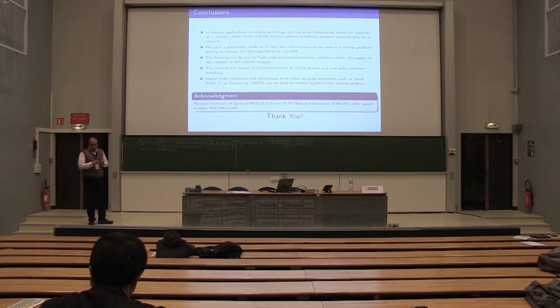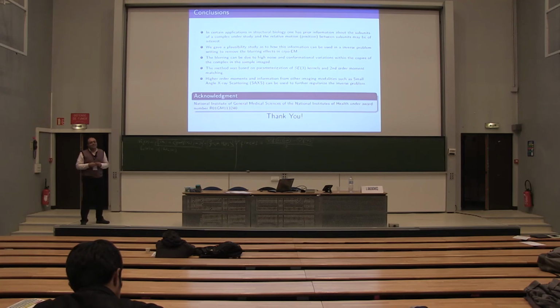Okay. And finally, I had one more. You mentioned that here you limited yourselves to the first 2 moments, mean and covariance. Do you think that trying to have higher order moments? We haven't tried it, but definitely that's one possibility. But in practice, I just want to be very modest about this, many other things can show up which derail everything. You mentioned the relation with blind source separation. Yes, one of the techniques is using higher order moments. Definitely, yeah.